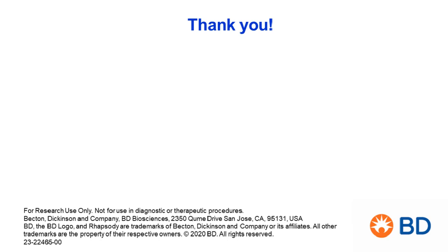Thank you. So you did mention being able to remove populations and look at different populations. Do you have any recommendations about how to deal with sample heterogeneity issues? Yes, heterogeneity is an interesting topic. As I just said in the previous question, there is no way to say a priori for most of the cases whether there is a very abundant population and a very rare population, and whether or not the markers that you're using in AbSeq are good enough to discern these populations.